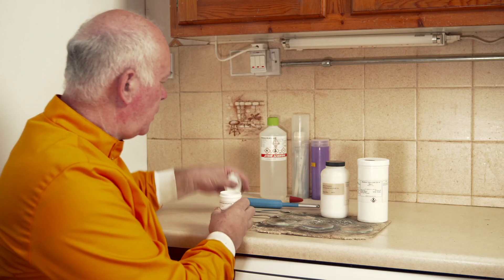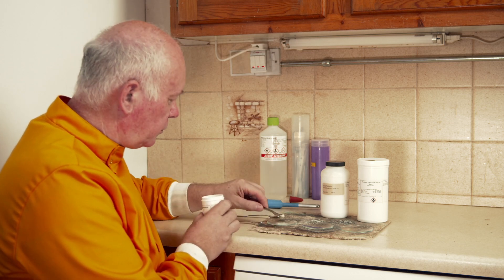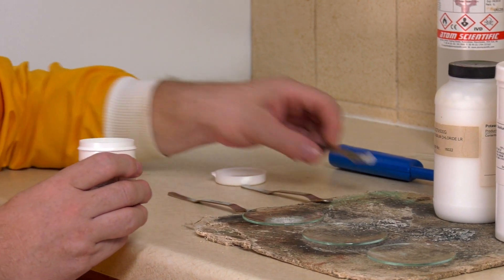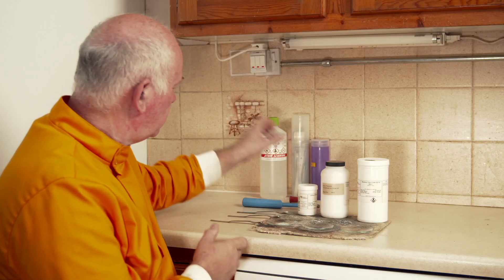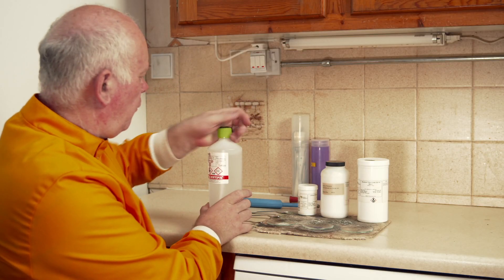So what we're going to do is we're going to do it a slightly different way. We're going to take one of these chemicals, and I'm going to take a small amount and place it on a watch glass. And to this watch glass, I'm going to add a small amount of methanol.